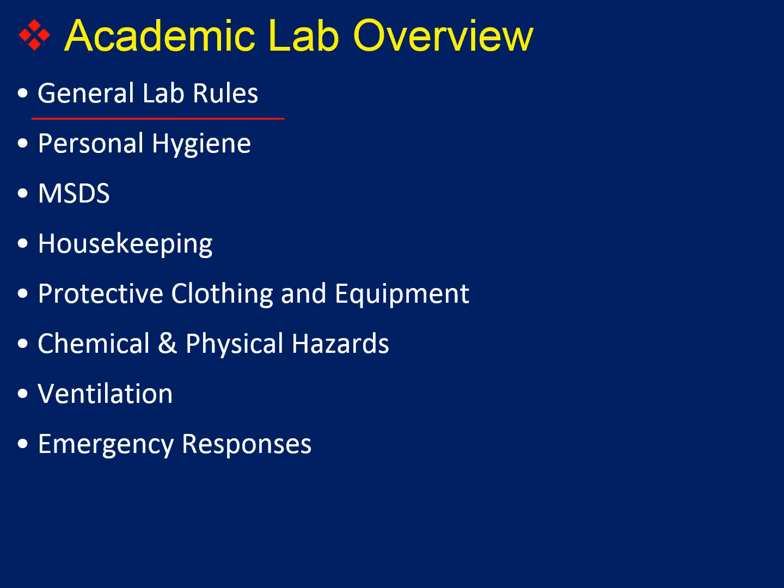So, going to the academic lab overview, we would like to talk about the general lab rules and personal hygiene, MSDS, housekeeping, protective clothing and equipment, chemical and physical hazards, ventilation, and finally the emergency responses.